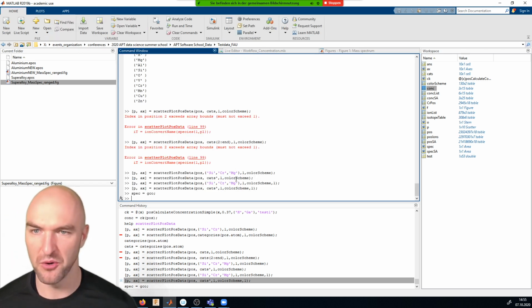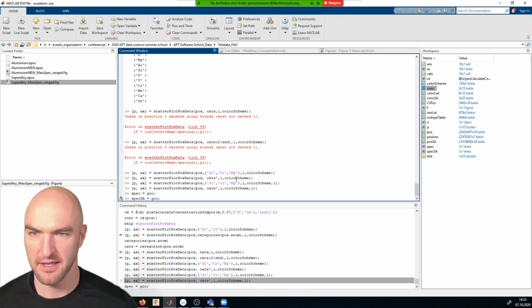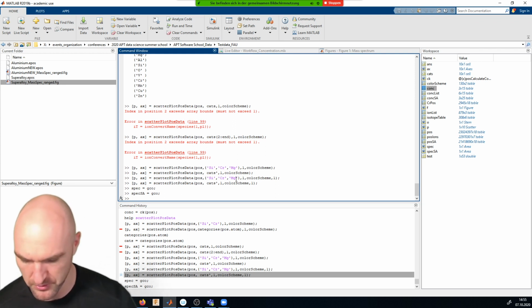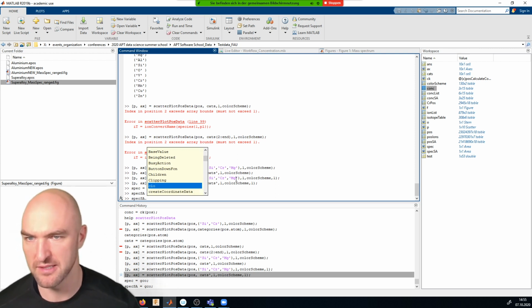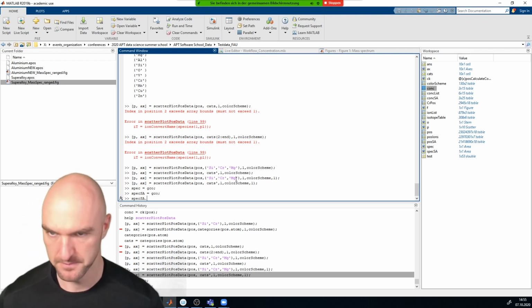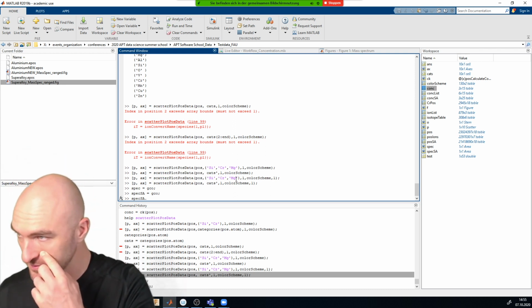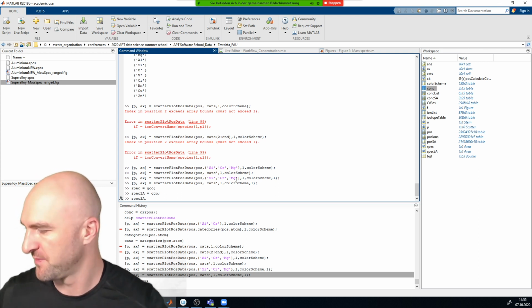And if you then go spec SA is get current object, then you should be able to go spec SA dot and then you will get some autocomplete. So there's obviously some dot indexing happening here. Can you try that for me quickly so that we can have a look at that? You can also share your screen if you like.